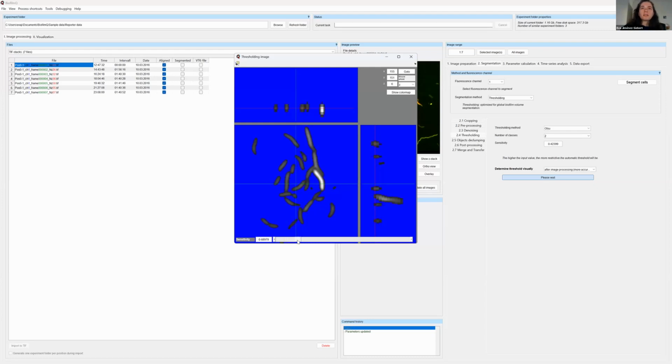And with the standard parameter, that would be 1, it would look like this. That would mean that my automatic segmentation would be too much segmentation. So I would get a very low volume segmented, and I would have to turn the sensitivity down until it looks the way I wanted. And in this case, I would go for something like this.